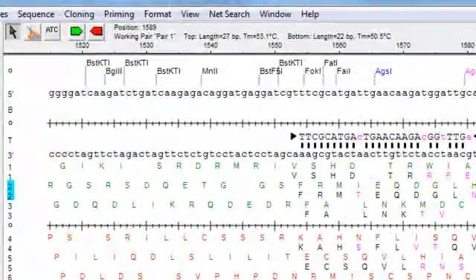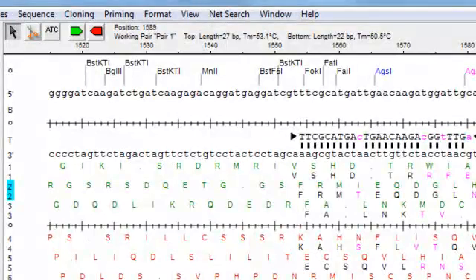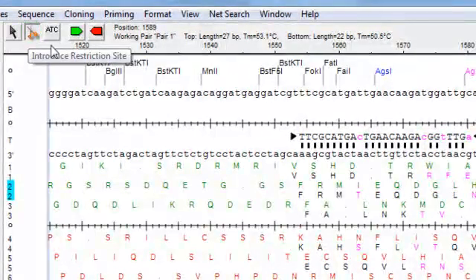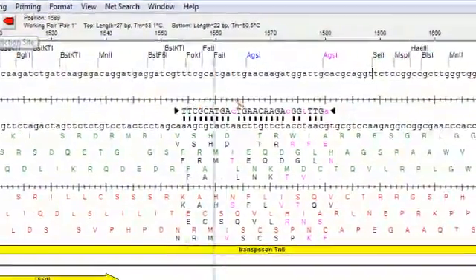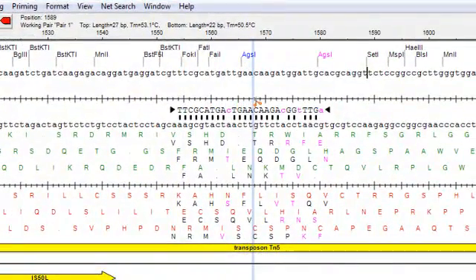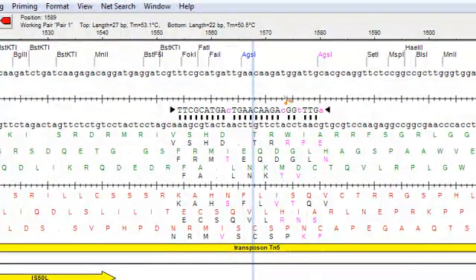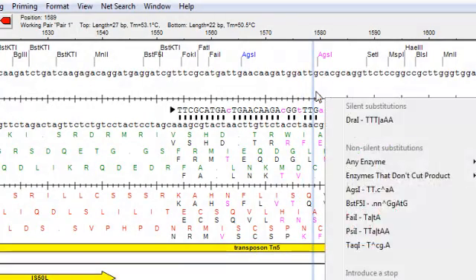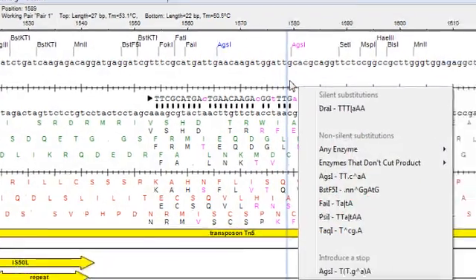The final editing mode available is restriction site mode, and you can access that by clicking on the scissor icon here. Once I'm in this mode, I can introduce a restriction site by clicking between the residues where I want to introduce the site and selecting an enzyme from the list provided.